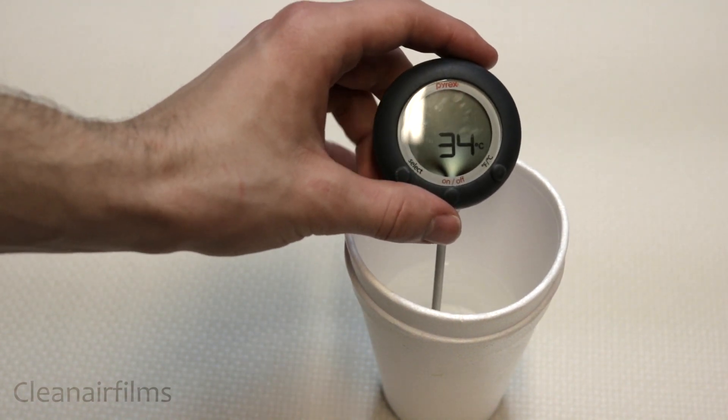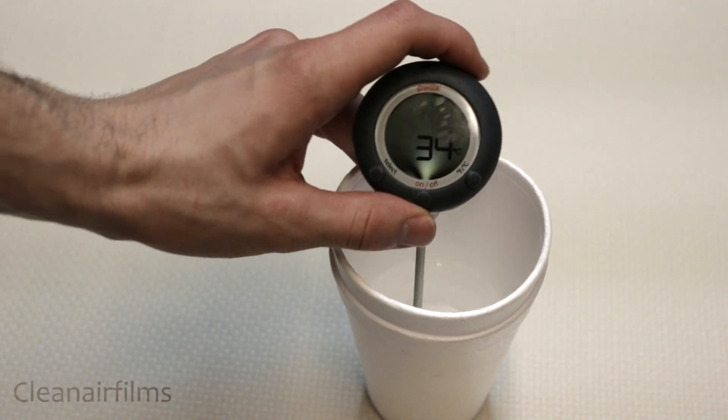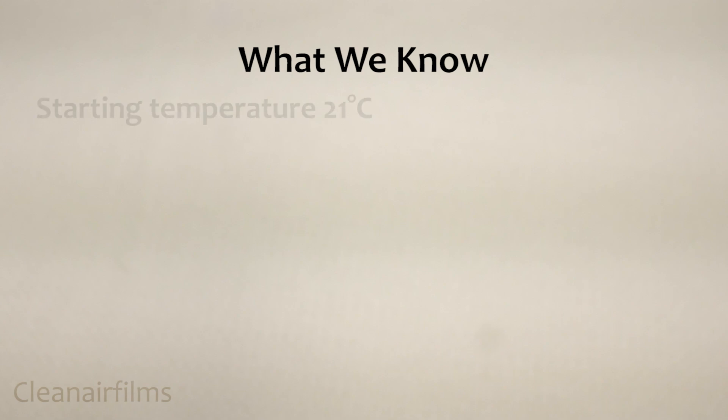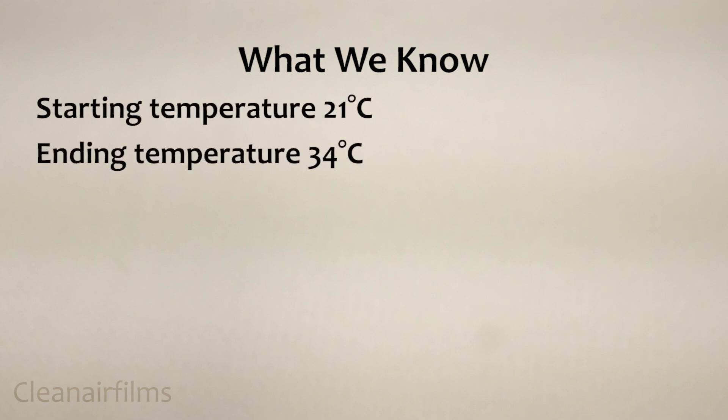Now that the reaction is complete it is time to begin doing the math. Here is what we know. The starting temperature was 21 degrees Celsius and the ending temperature was 34 degrees Celsius.